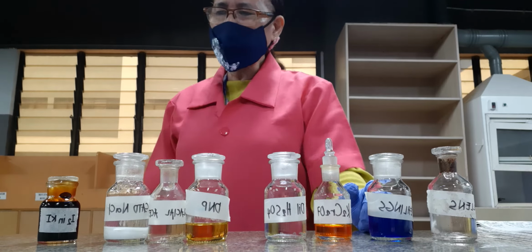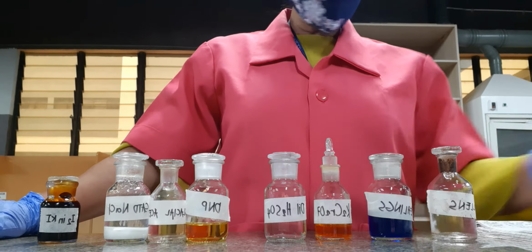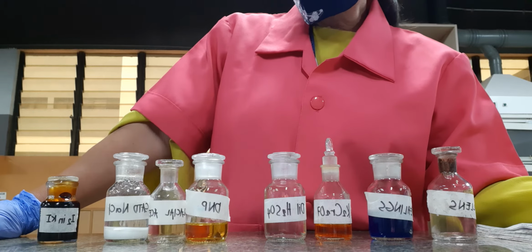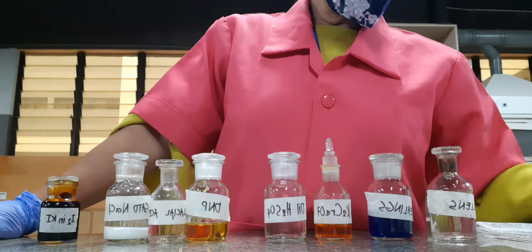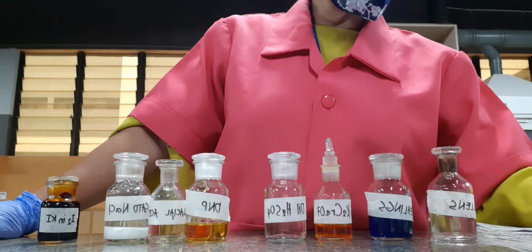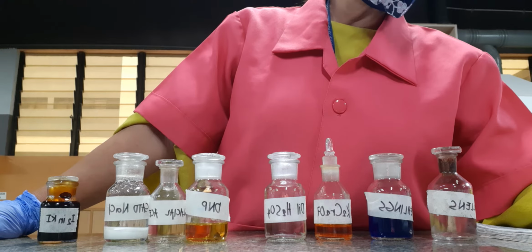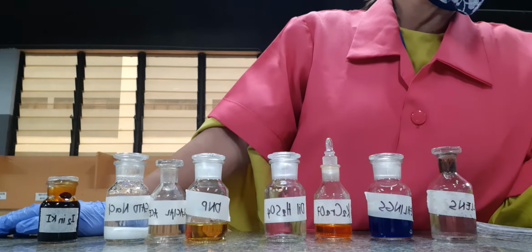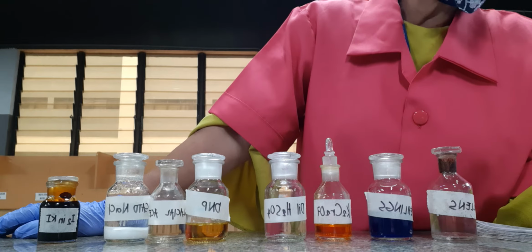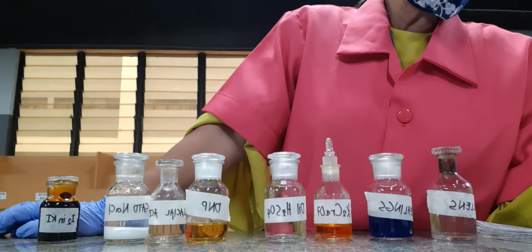Okay, so we begin by having our substances, the aldehydes and ketones, for the miscibility test with water. Will it undergo a reaction with water, or will it be miscible in water? So you have in your lab guide test tubes 1 to 5, which includes test tube 1, where we have formaldehyde.